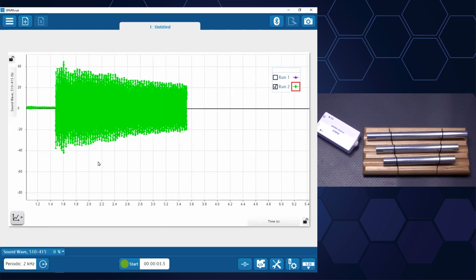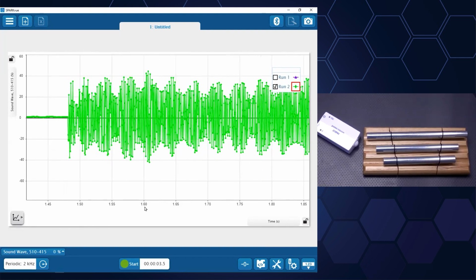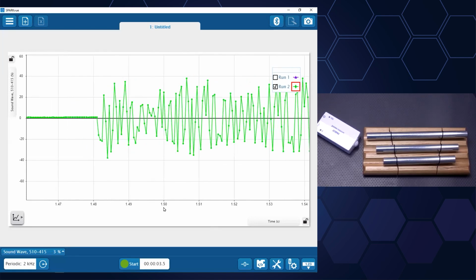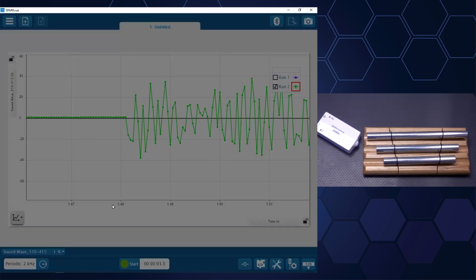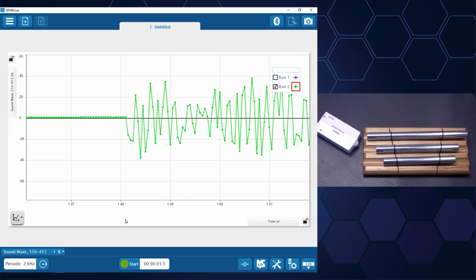All right. I'll tell you, on some machines at this point, I'll say I can't keep up. On this machine, it happens to do it. But still, I'm not getting good results. This isn't the clean signal I'm expecting from a clean chime. So let me tell you that this isn't the right approach, because even at 2 kilohertz, which is the maximum I can go to in this mode, that's not fast enough to be measuring variations in signal that themselves may be happening at kilohertz speed.